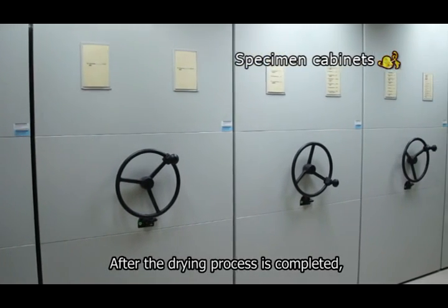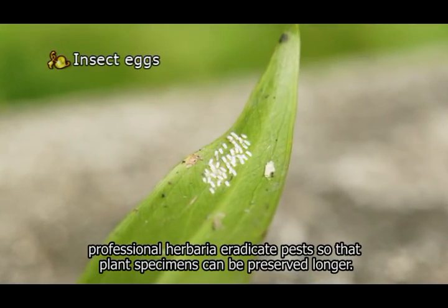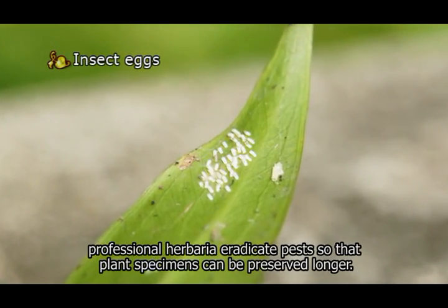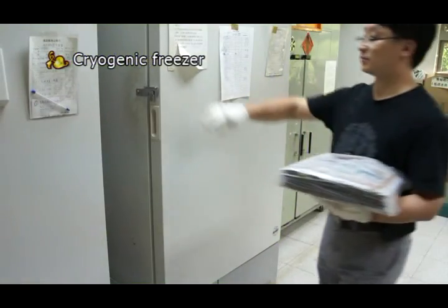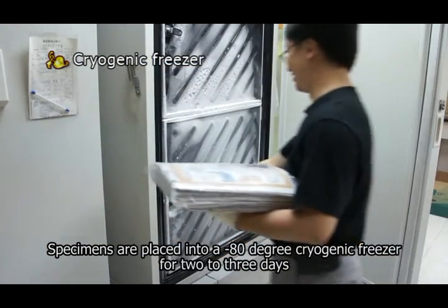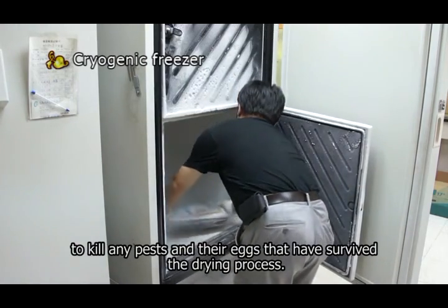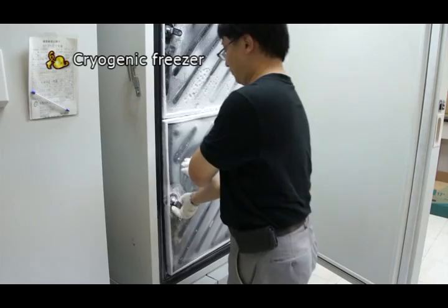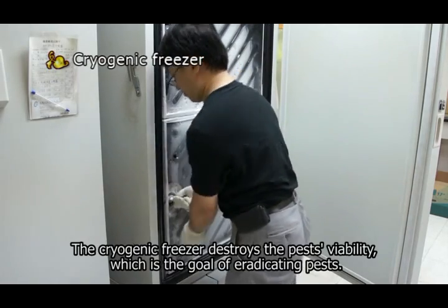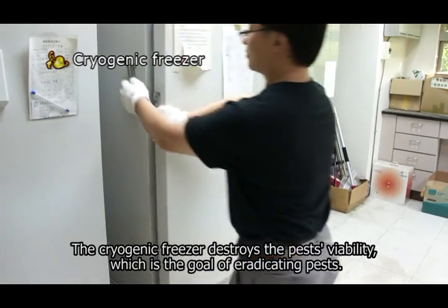After the drying process is completed, professional herbaria eradicate pests so that plant specimens can be preserved longer. Specimens are placed into a minus 80 degree cryogenic freezer for 2 to 3 days to kill any pests and their eggs that have survived the drying process. The cryogenic freezer destroys the pest's viability, which is the goal of eradicating pests.